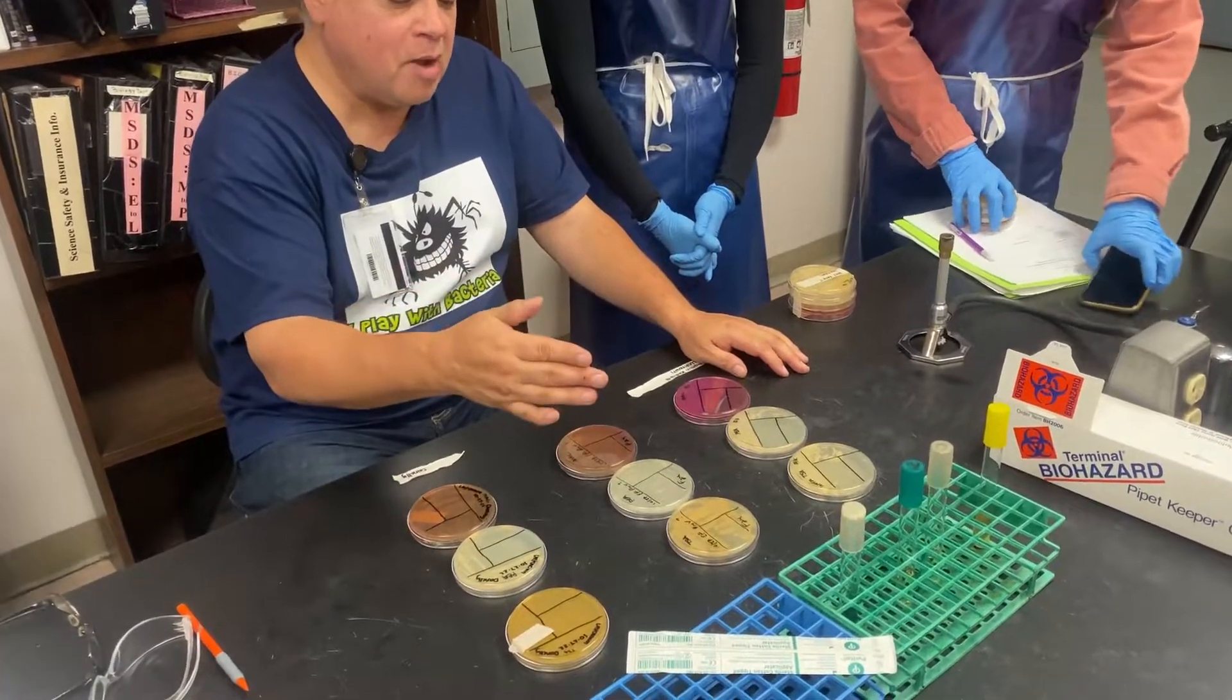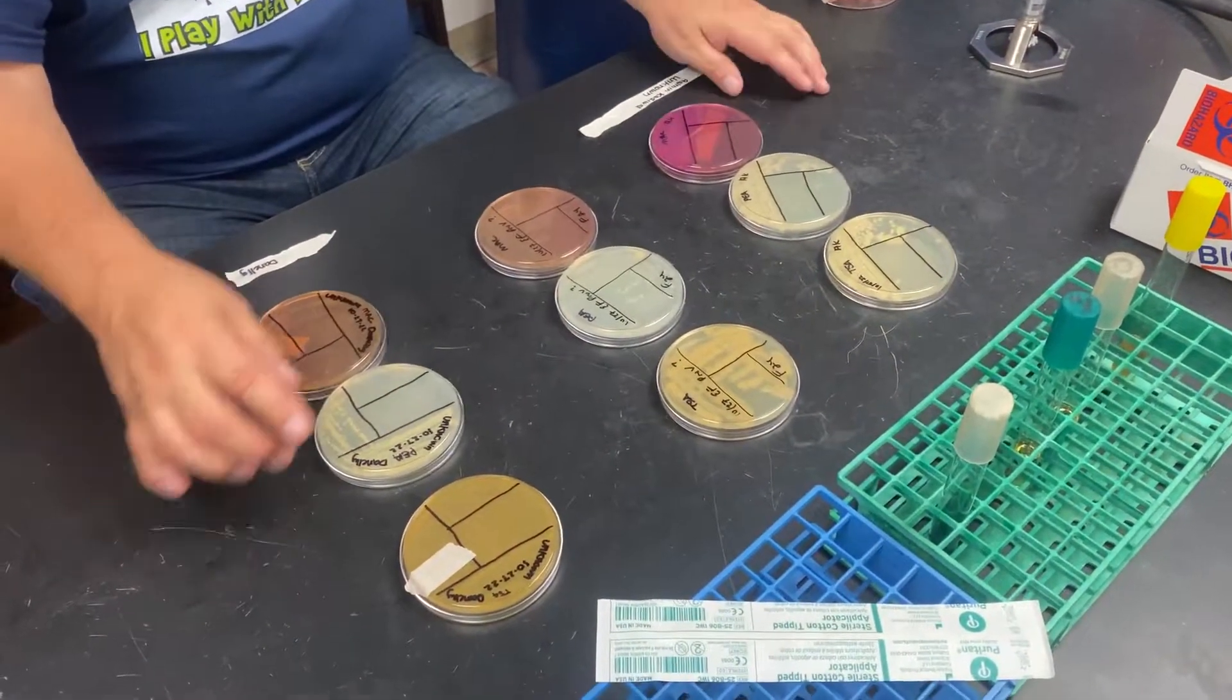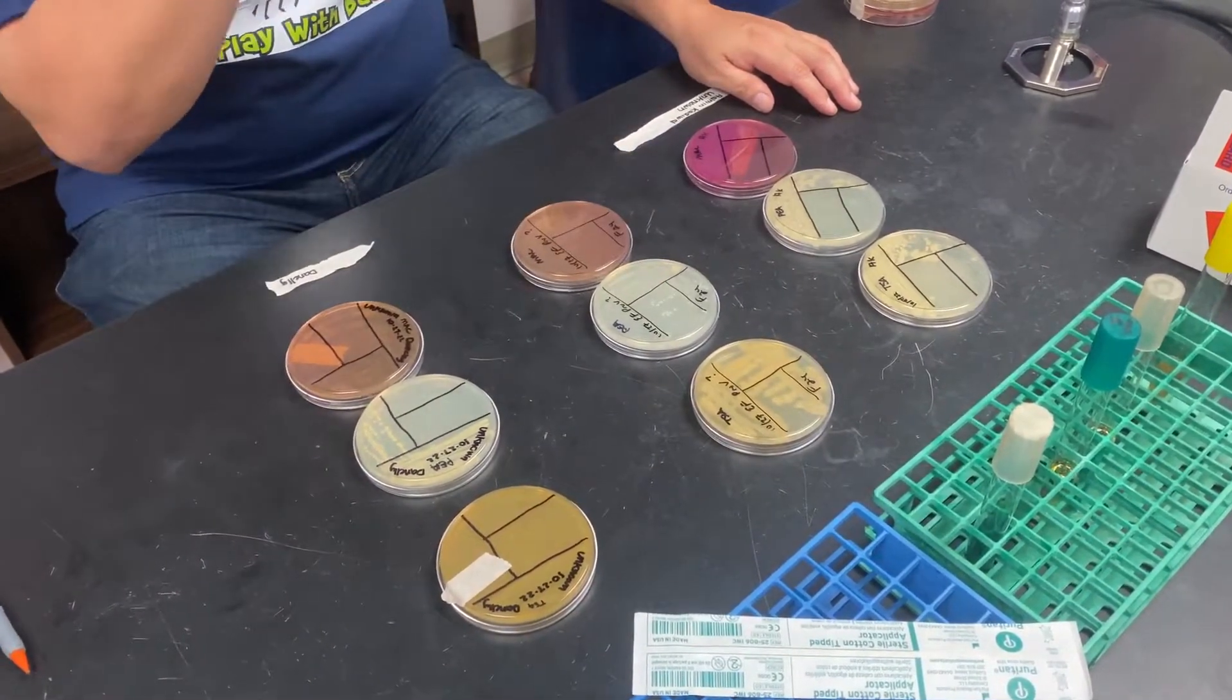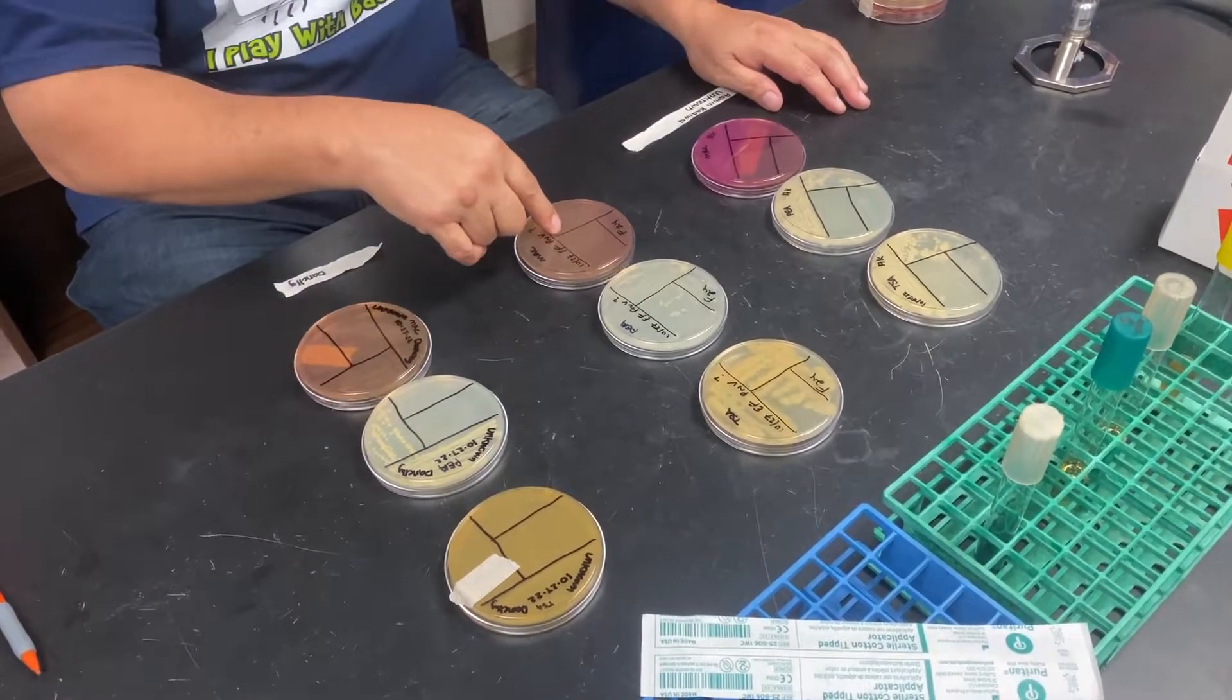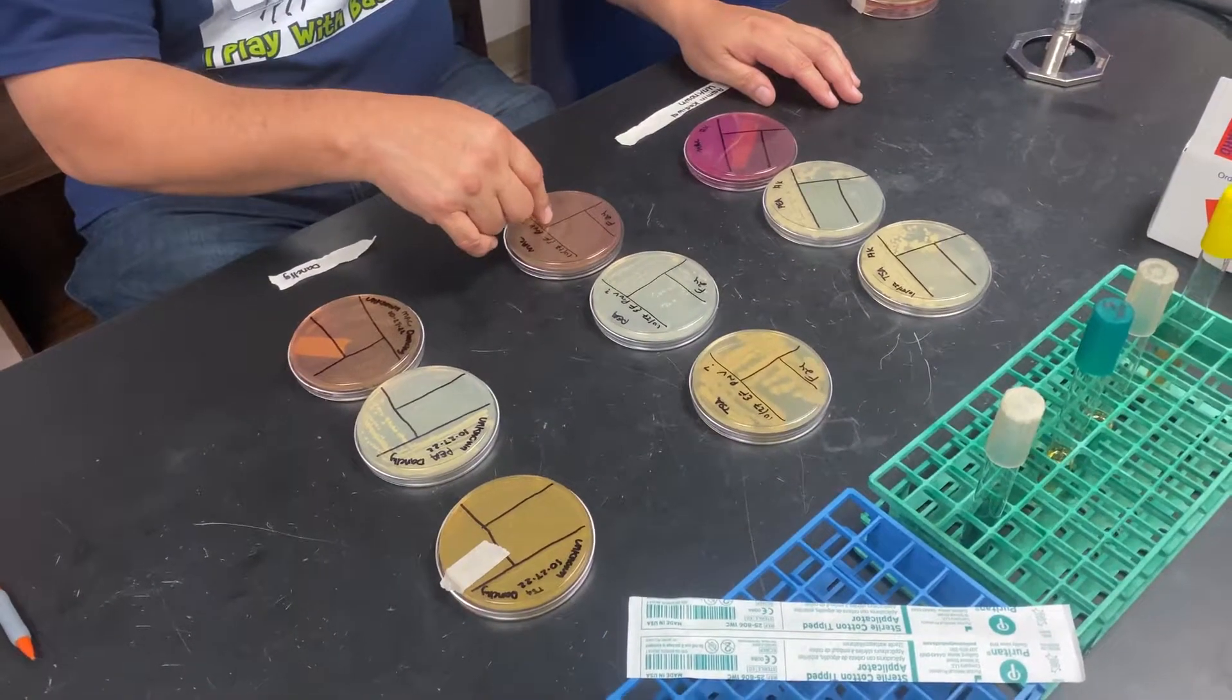So first of all, let's remind ourselves: TSA will grow what? Everything. PEA will grow what? Gram-positive, but it'll inhibit gram-negative. But it won't kill gram-negatives, right? And McConkie will do what? Gram-negative grow, inhibit gram-positive. Good.